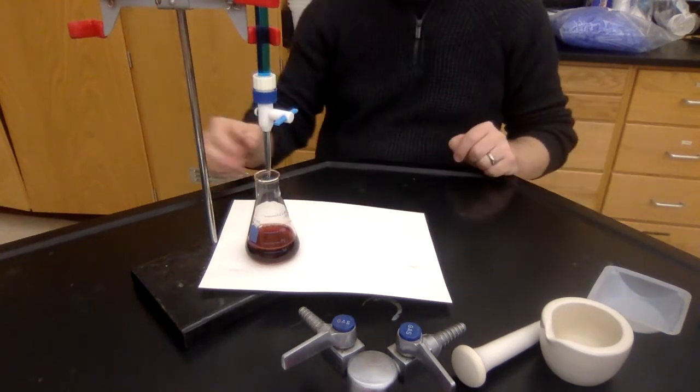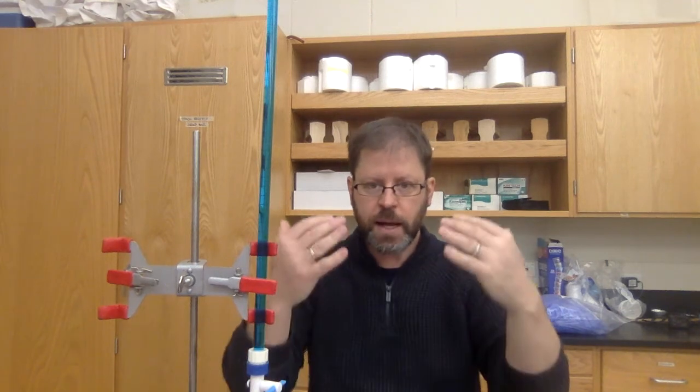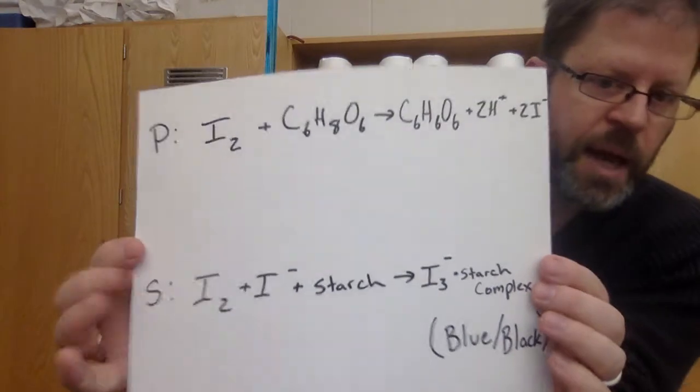We most certainly will have a lot of questions that happen on lab day itself. But if you can come in and you walk up to the scale and you weigh one of these within the first handful of minutes, you're in good shape. So I really want you to sit down and play with the calculations so that you know what's going on.